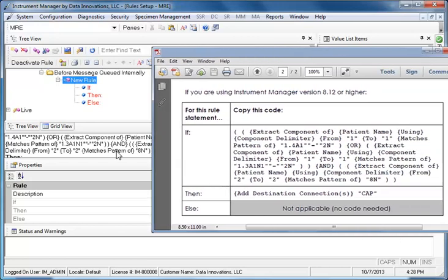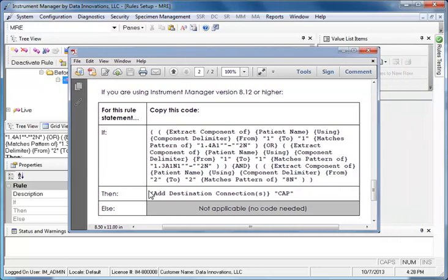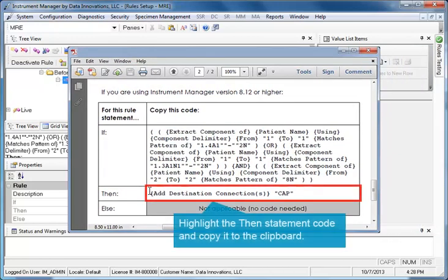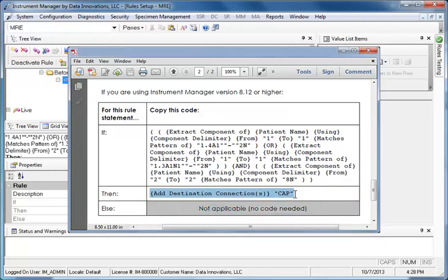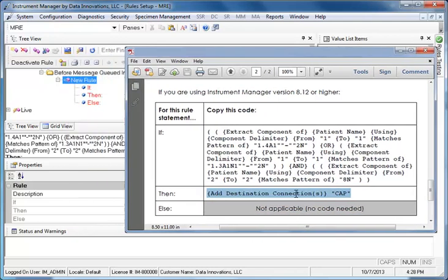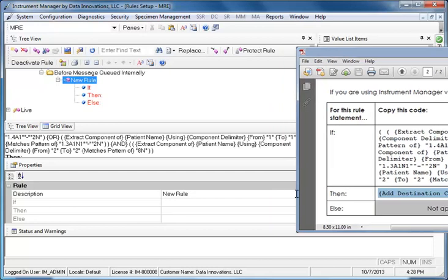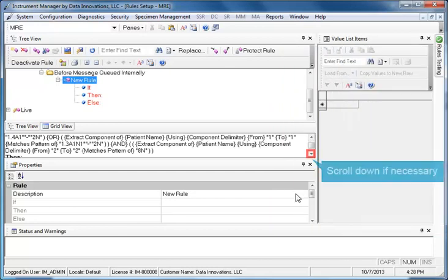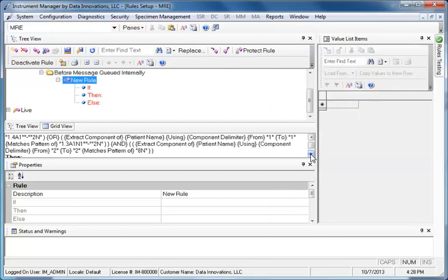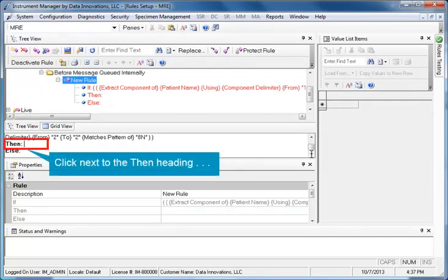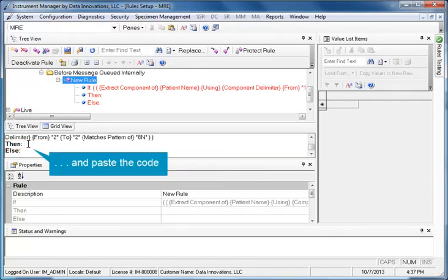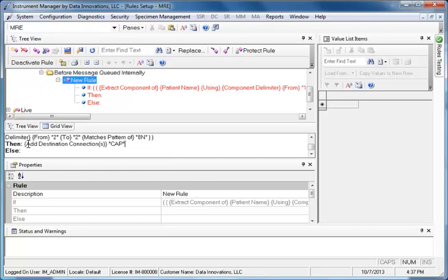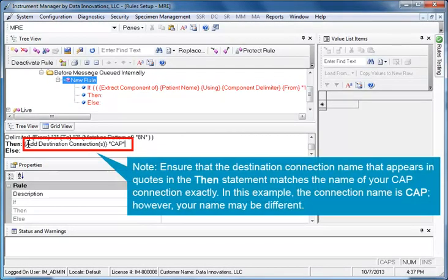Switch back to the User Guide. Highlight the Then statement code and copy it to the clipboard. Switch back to Instrument Manager. Scroll down if necessary to show the Then heading. Click next to the Then heading and paste the code.